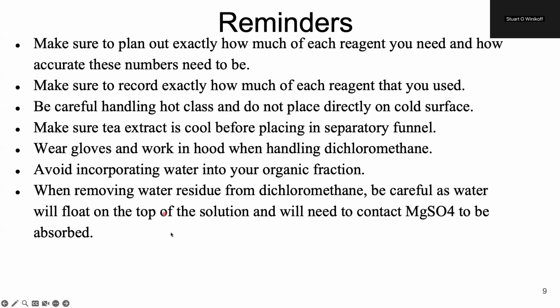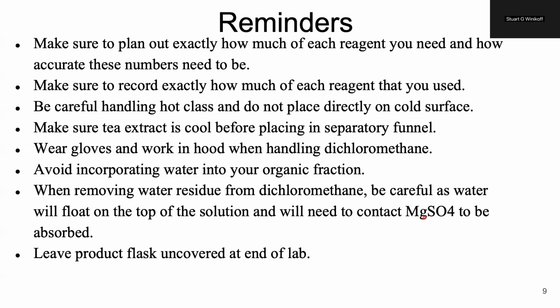Now, when you're removing that water residue, again, be careful that water is going to float on top of your organic solution. So if you're trying to make sure that magnesium sulfate comes in contact with your aqueous layer, you might need to mix it up a little bit more. Alternatively, you can try to shake any magnesium sulfate directly on top of any water beads you see floating.